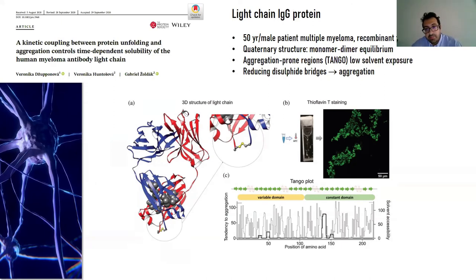So when we look at the protein and heat it for a while, you can see aggregates. These aggregates can be seen here as white blobs and white structures, large structures, which can be stained by thioflavin under confocal microscopy. And you see roughly the shape of these aggregates.